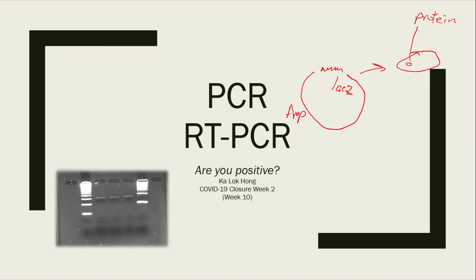Okay, and here looking at this little left hand corner graph, we have an agarose gel image, and inside here, these little pieces, these are DNA, double-stranded DNA.